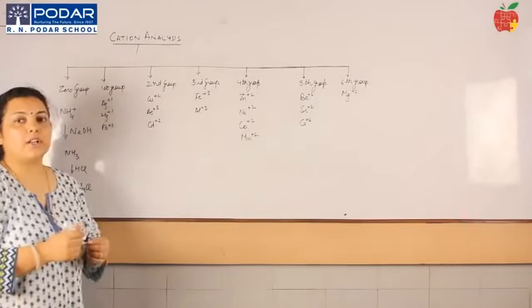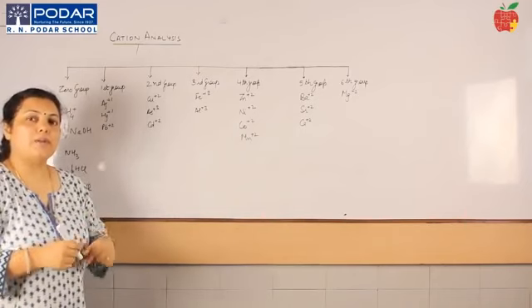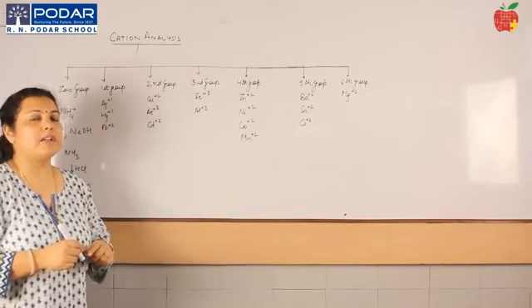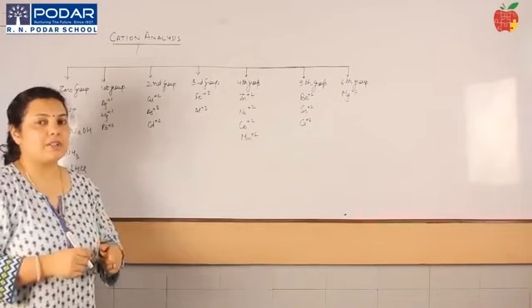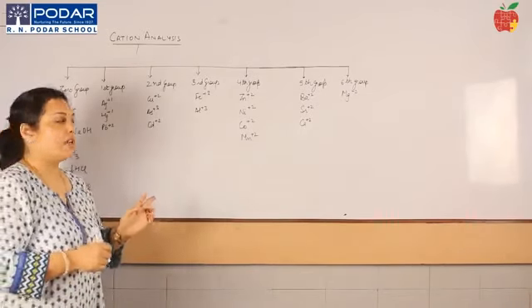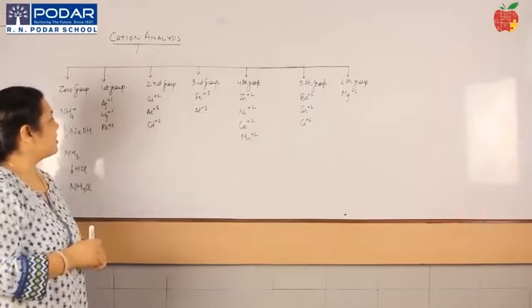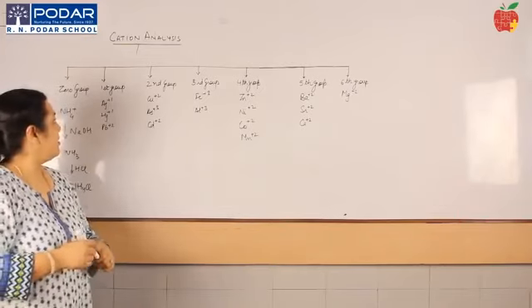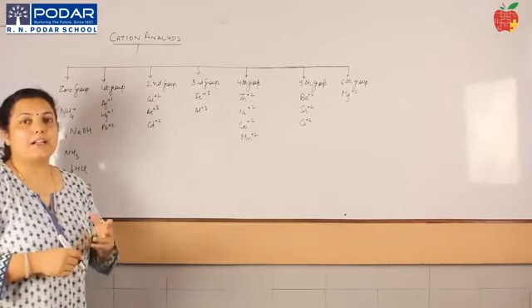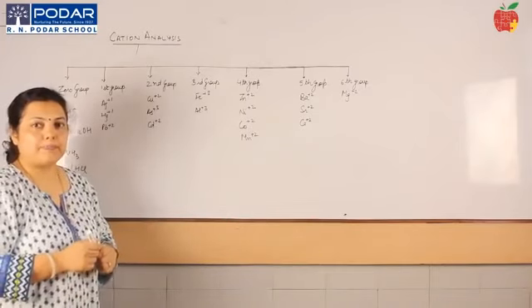After you have got this smell of ammonia and dense white fumes of ammonium chloride, you can perform the confirmatory test for ammonium ion, which is with Nessler's reagent. Suppose there is no observation on adding NaOH, then we move on to the first group. In the first group, you have silver ions, mercurous ions and lead ions. Mercury and silver are a little costly, so we only do lead salts in the lab.